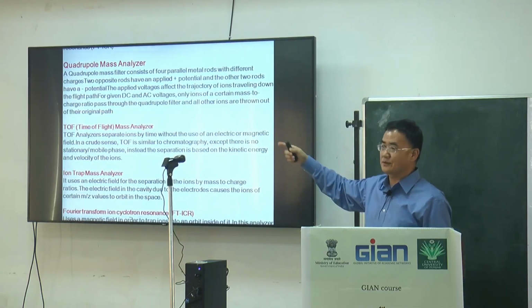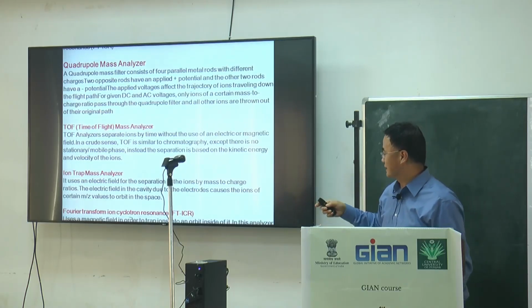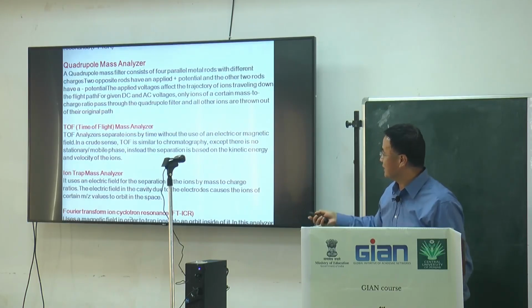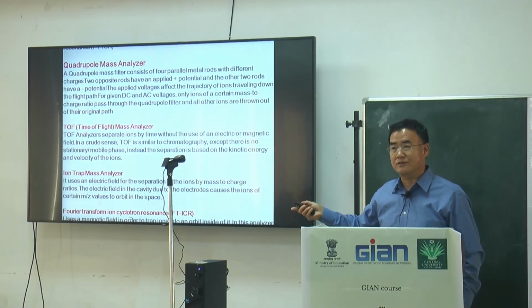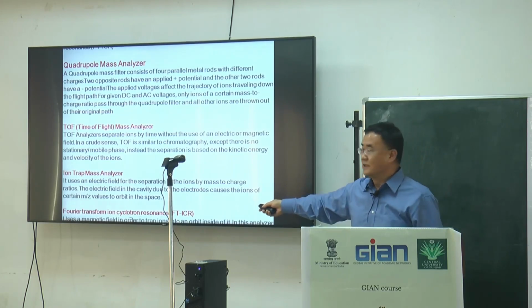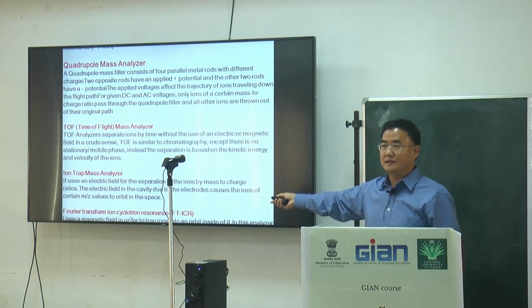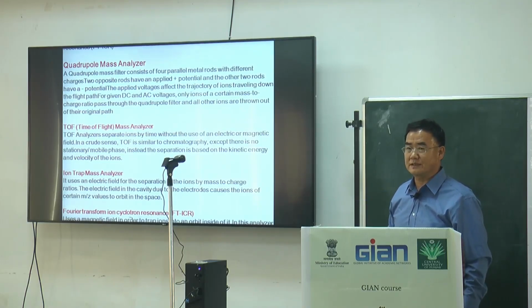The mass analyzer can also be coupled with GC, right? And with MS there are also ion traps, like Q Exactive and Orbitrap, used for proteomics analysis and also for metabolite analysis. It's a pretty advanced analyzer by Thermo Fisher.